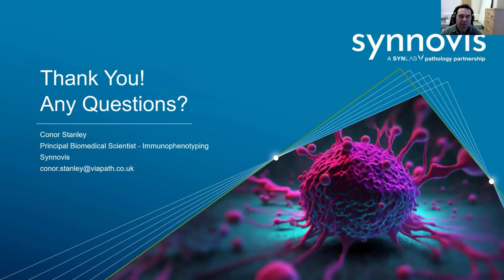What would you use? I think it probably depends on what you're looking to analyze, or what testing you're looking to do. I know that there are very good packages. For instance, Beckman Coulter have an analyzer called the Aquios, which is a plug and play analyzer, but you're limited in the panels that you can run on it. But if you just wanted to look at lymphocyte subsets, then it's a really good solution. You load the sample on, and it spits out a result for you. You then have to be able to read the result, but it is quite simple to set up.